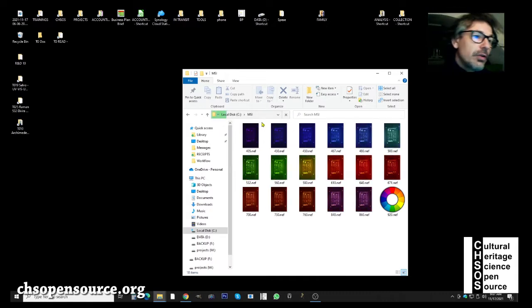First of all, remember this is explained in the video on how to shoot the images. The images should be in the raw format. Then basically the process involves splitting these images into the red, the green and the blue channel.